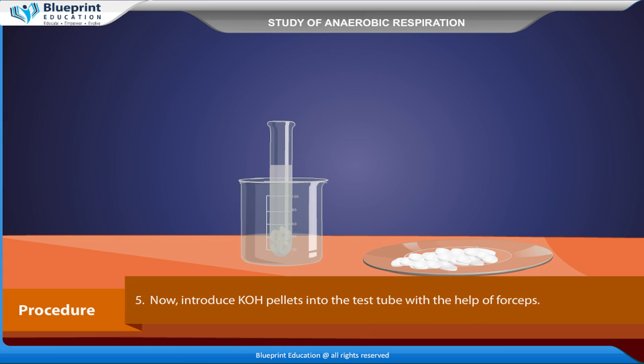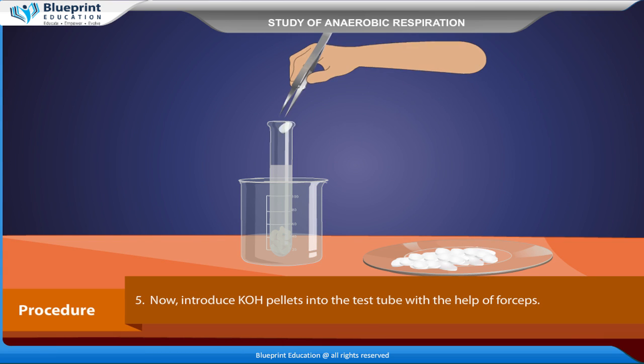Now, introduce KOH pellets into the test tube with the help of forceps.